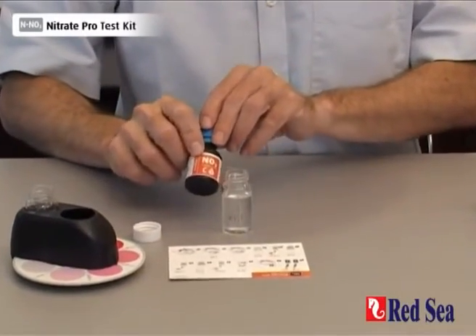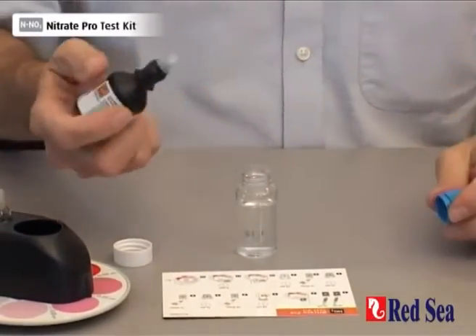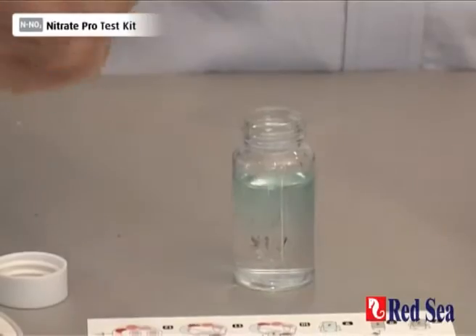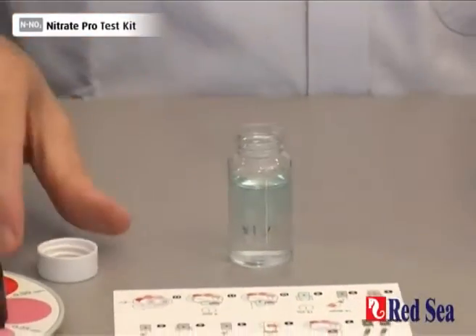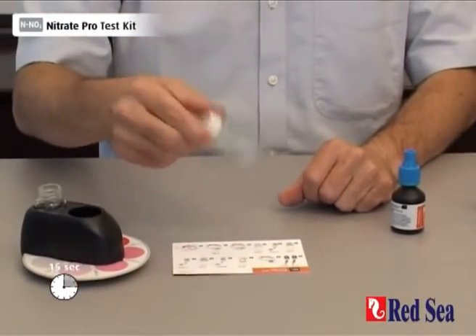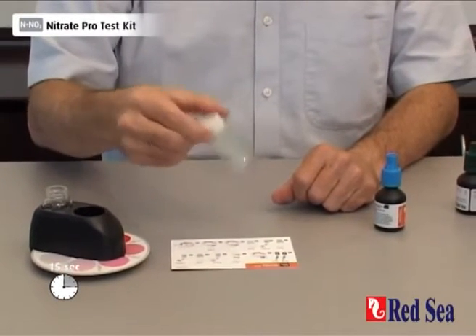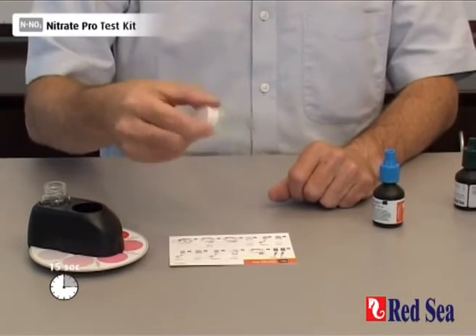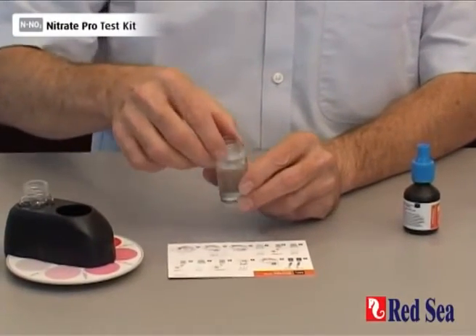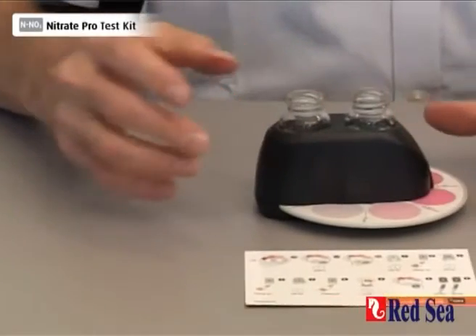Lastly, we add another five drops of Reagent C. And again, we shake for 15 seconds. When that's done, remove the lid and place the vial into the comparator, and we are now going to wait for nine minutes for the reaction to develop.